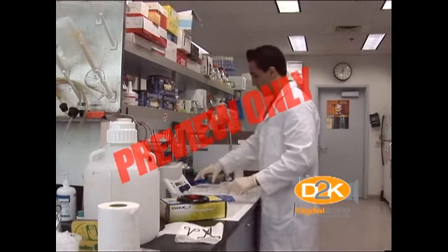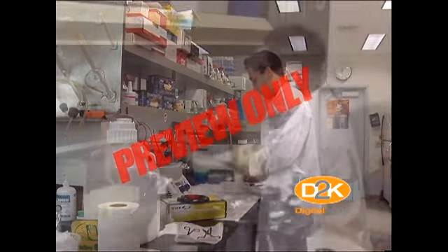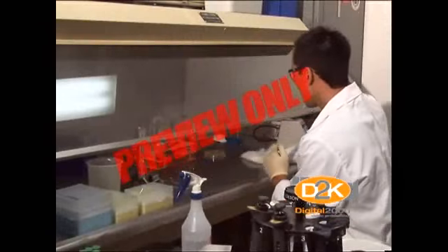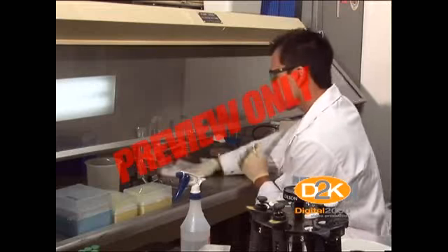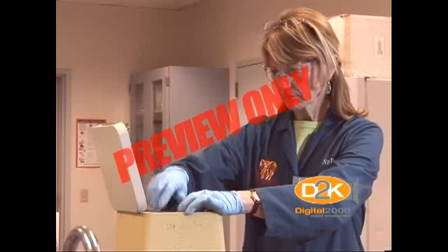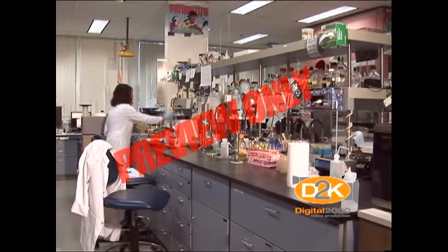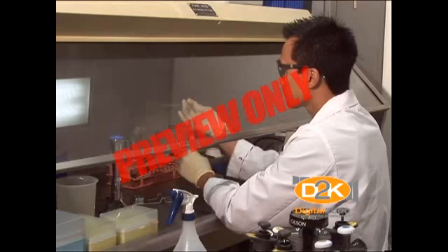Good microbial techniques and safety equipment provide sufficient primary containment. Primary barriers include safety equipment such as biological safety cabinets, enclosed containers, and enclosed centrifuge containers. Occasionally, when it is impractical for you to work in biological safety cabinets, personal protective equipment may act as the primary barrier between personnel and infectious materials.